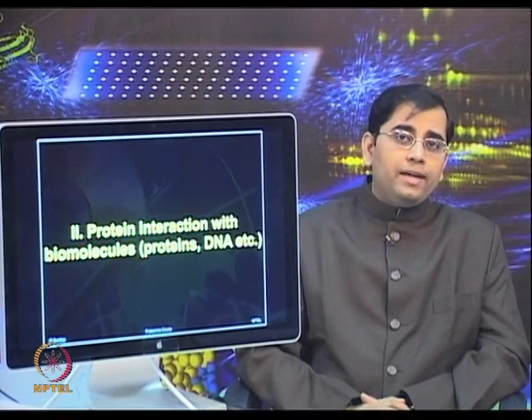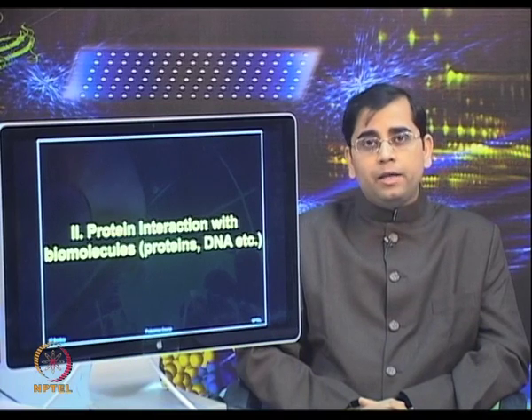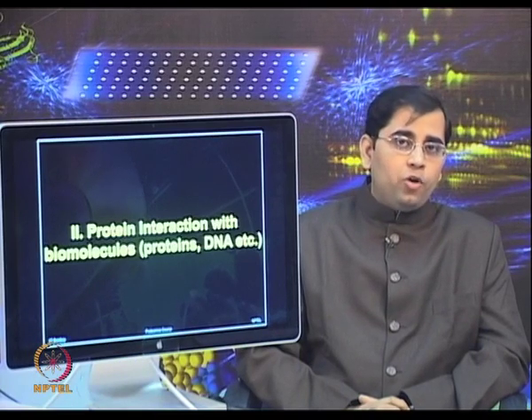So, after looking at various types of applications for biomarker discovery, including 2 studies which we discussed in more detail and 2 studies which I showed you briefly in the animations, I hope you are able to get a feel of various types of assays which people perform to identify biomarkers on protein microarray platform.